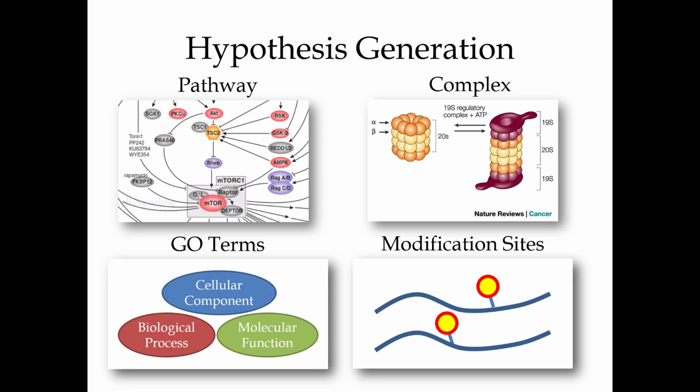So how do you generate a hypothesis, right? What's your hypothesis? And we would say that it's still plenty useful to just have a targeted hypothesis here. You can use DIA data for discovery proteomics, and Ben talked about that. It kind of treads the whole range, and we're going to get into discovery, using large statistical analysis of DIA data, a little bit later.